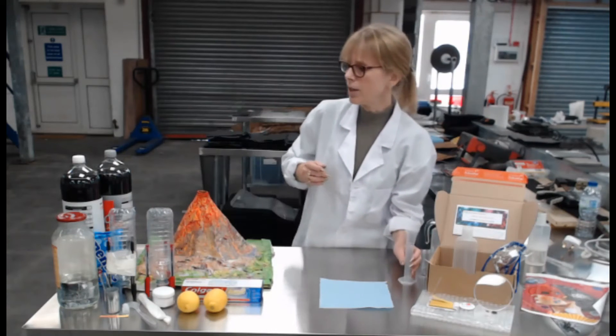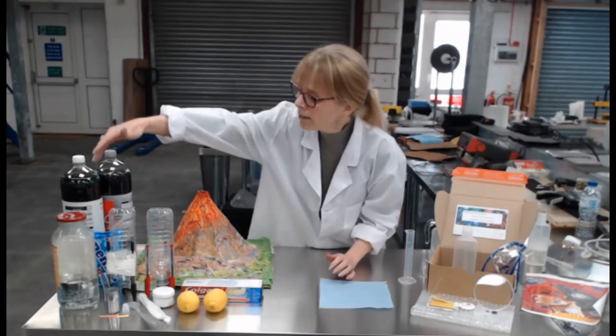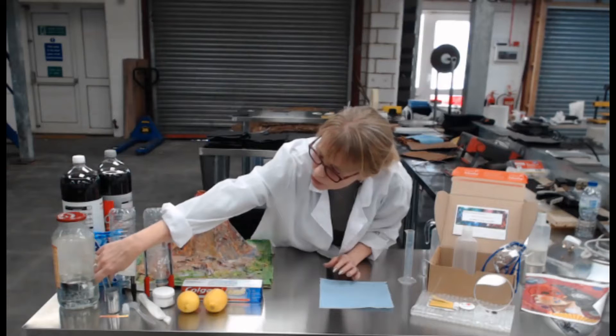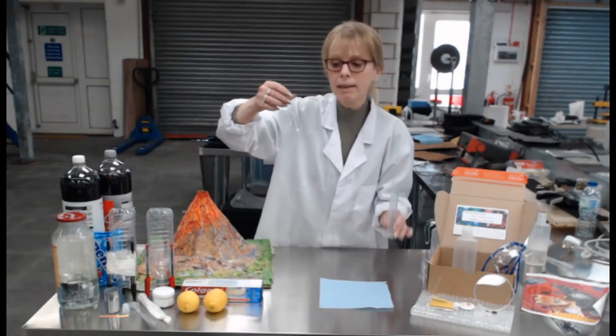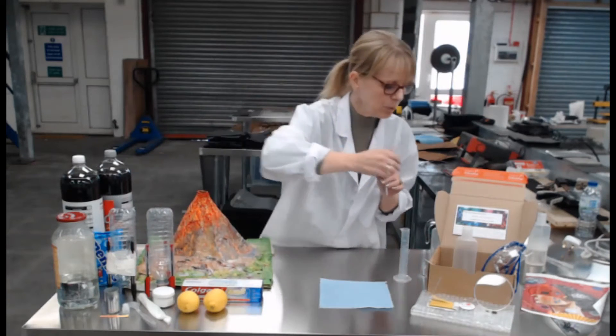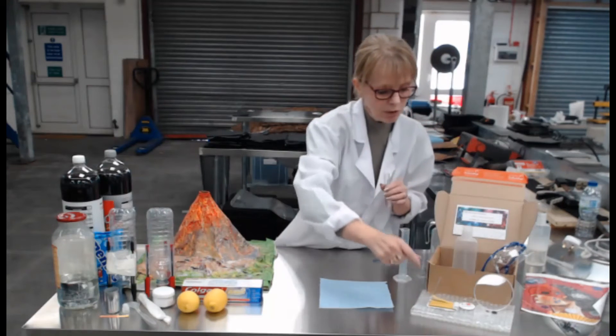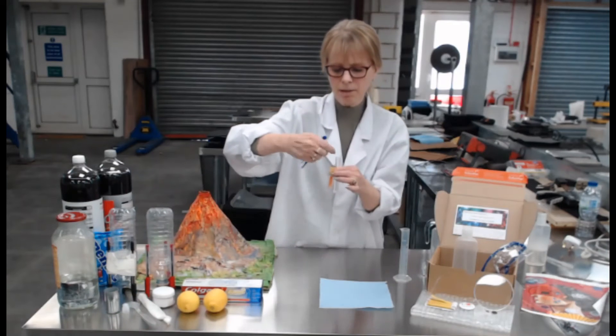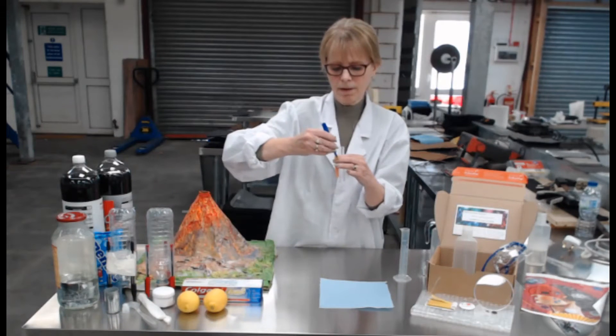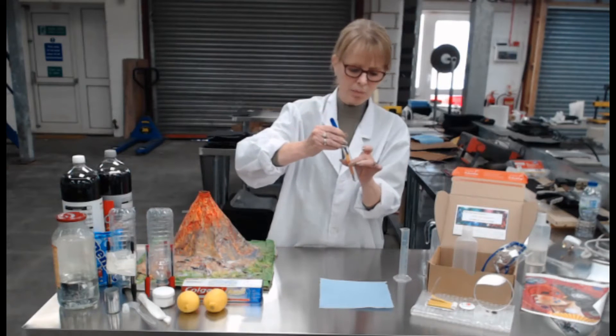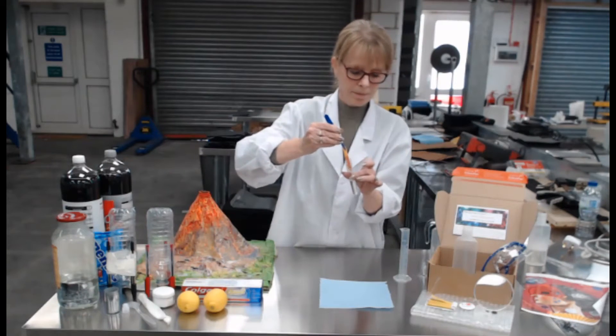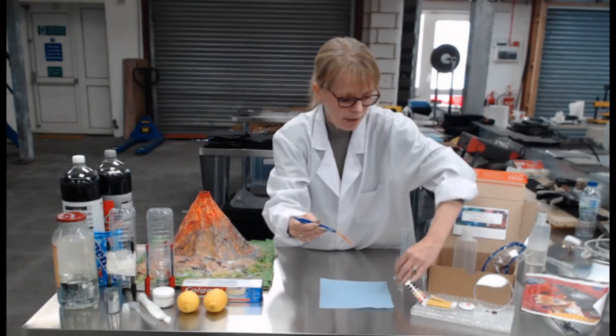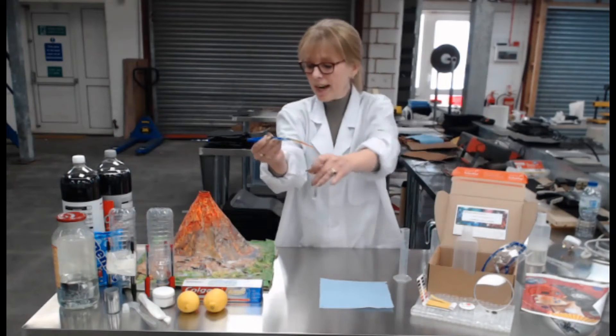We've also got a measuring cylinder for 25 milliliters which again you can use for something as simple as trying some of the different weak acids that you have at home: cola, vinegar, lemon juice. And you can measure, say, five milliliters carefully into one of the test tubes. You get two in here and you can use some of the universal indicator paper and your tweezers that come in. Put your universal indicator paper in and measure it against the pH scale to show that it's an acid.